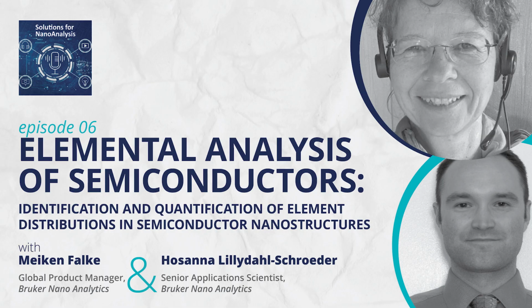So could you give us some additional examples on where and how EDS has some clear advantages versus EELS or other analytical techniques for TEM? Well, to broaden the first example with the lung tissue a bit, of course, in biological specimens, life science as a whole, where we always have a mixture of all sorts of elements, light elements, heavy elements, unknown combinations of elements. So EDS is really powerful there.